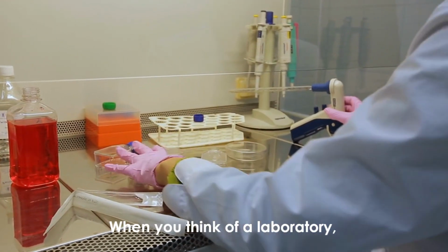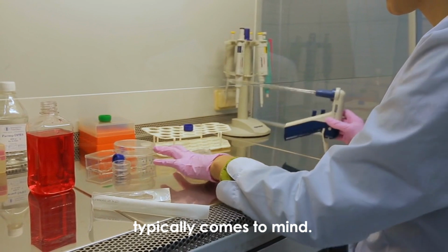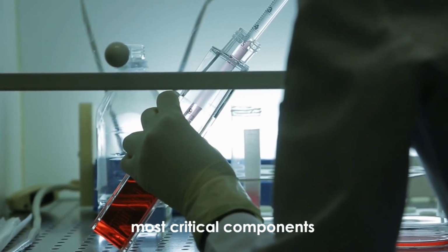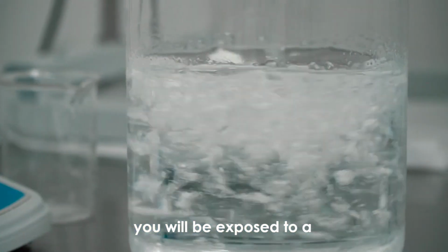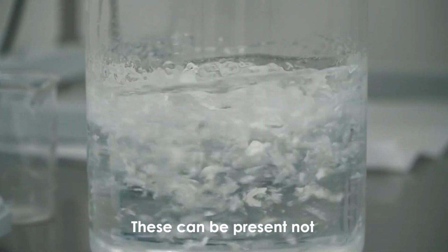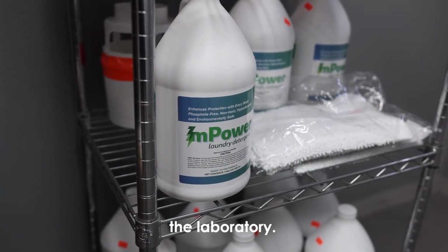When you think of a laboratory, an image of technicians, lab coats, and experiments typically comes to mind. However, this is immediately followed by one of the most critical components of a laboratory: chemicals. As you operate in and out of a laboratory, you will be exposed to a variety of chemicals, substances, and mixtures. These can be present not only during experiments, but also stored and transported throughout the laboratory.